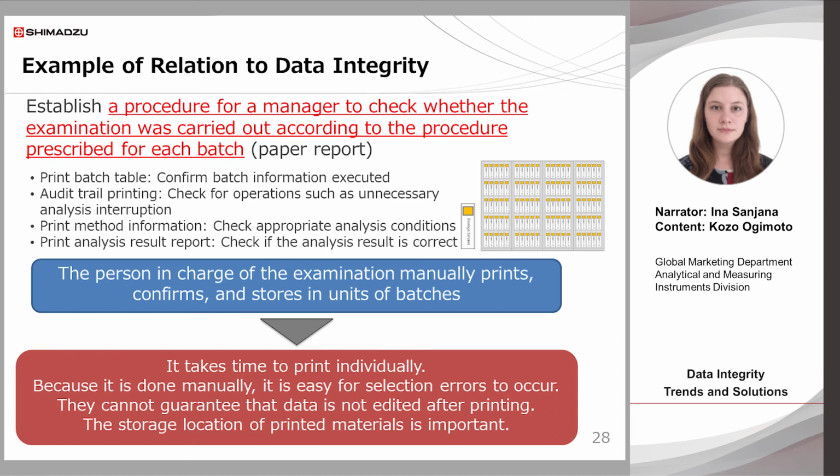If such an operation is found, the manager will check with the operator. If the action was appropriate, there's no problem, but if the action did not follow procedure, the batch should be retested. The manager will also print information about the methods to verify that the analysis conditions were appropriate. The analysis results report should verify that the results are correct. The manager has to perform these tasks in batches.